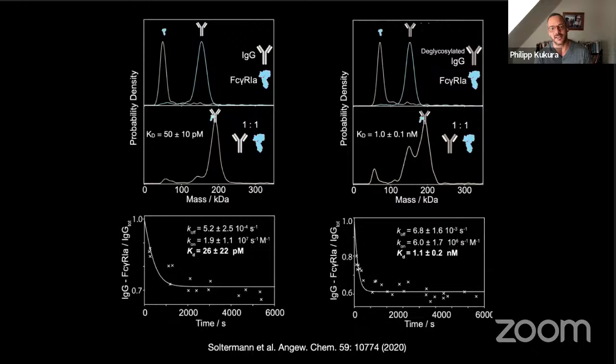The question is absolutely correct. It may well affect what we observe. But what's interesting is, even as I will show you on the next slides, the conversion between mass and contrast for DNA and proteins, I mean, they are massively different, right? Even that difference is not that big. My interpretation is, well, biomolecules are all kind of the same. The reason why when you look at a cell it just looks like snot, there's nothing there, is because it's all the same kind of stuff. It's not like gold and rocks and water, it's all organic stuff, without much delocalized electrons, no response in the visible. So it all looks the same, and I think that's why we roughly always get the same behavior.